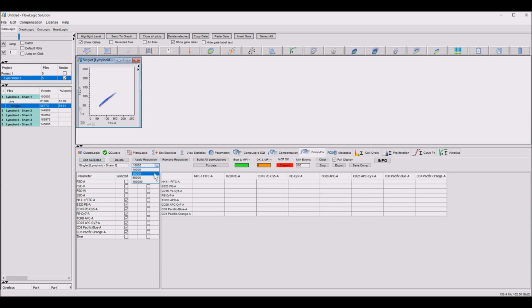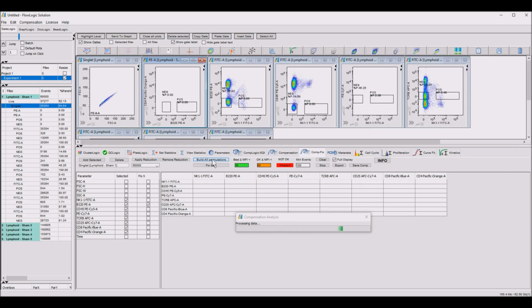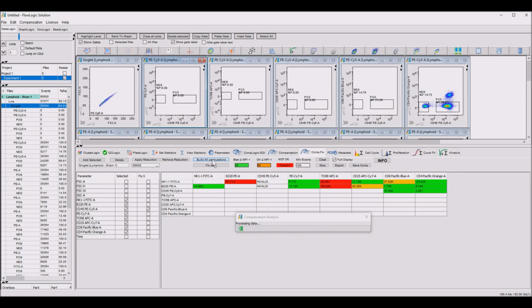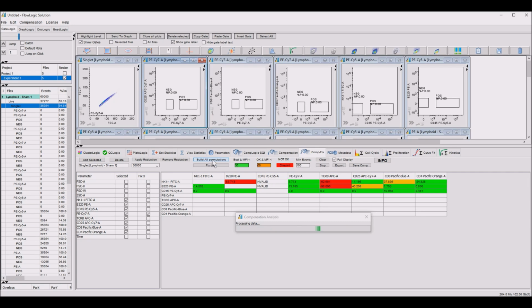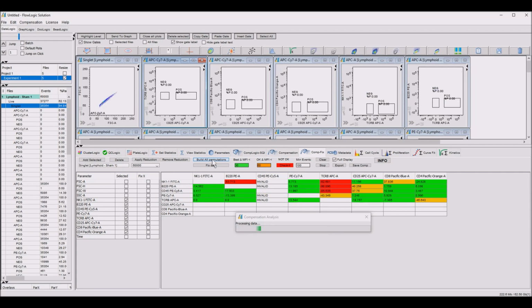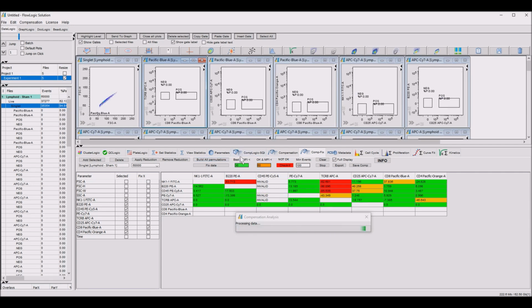Now, for the purpose of this presentation, we will do a data reduction. So in this way, you know our work. You can see that we set up the file at 60,000, and now we build all the permutations. Building all the permutations is very useful because you can go through and verify all your data visually, and in the table you can see how the data is built.